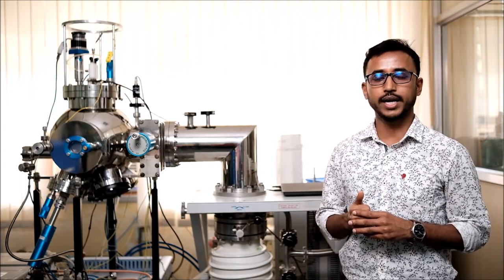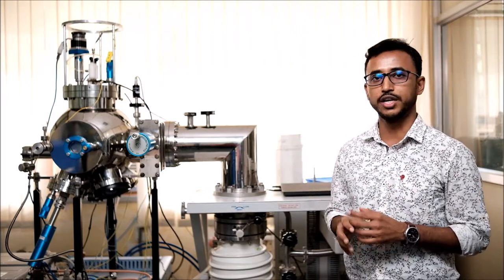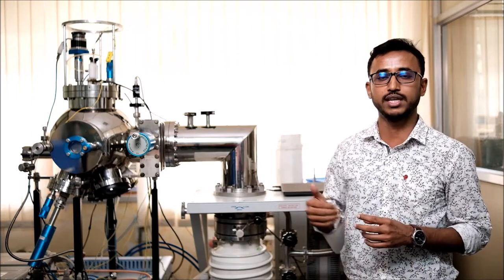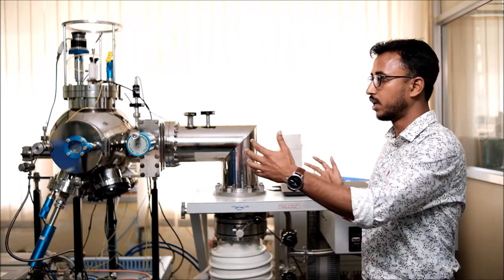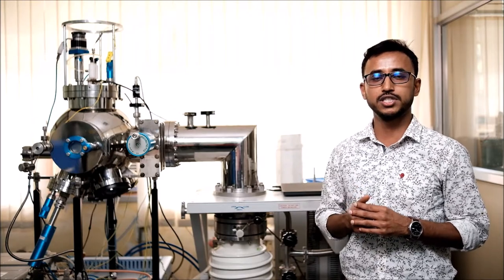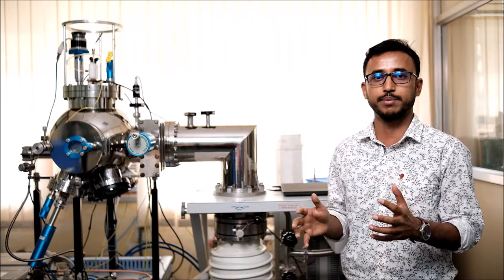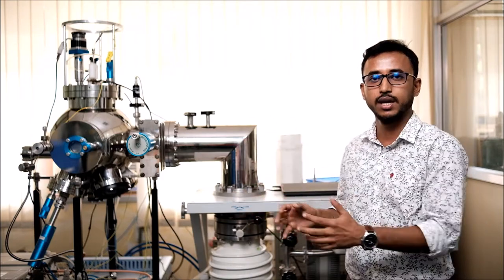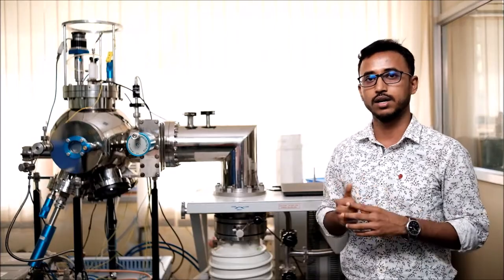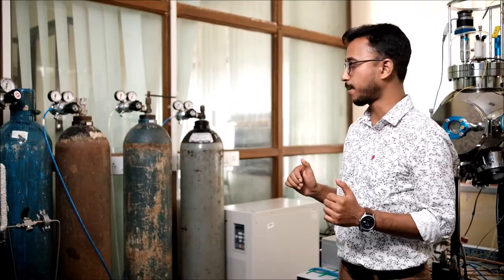I have kept the video in two parts. In the first part, I will introduce all the parts of the instrument, and then through a deposition of a thin film I will show how it is operated. I hope this video will help you understand how the sputtering working principle is executed and how we can grow a thin and uniform layer for our application. Let me introduce you to the important parts of the system.